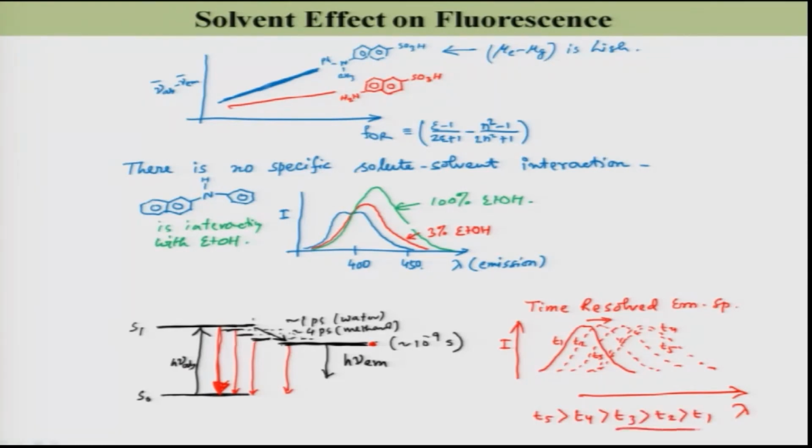Here these emission spectra are different, but these two emission spectra are the very same. That means it has reached the fully solvated state. After that time there is no longer any solvation taking place. It has reached the most stabilized state, and that state is what we have seen in our Lippert-Mataga equation.